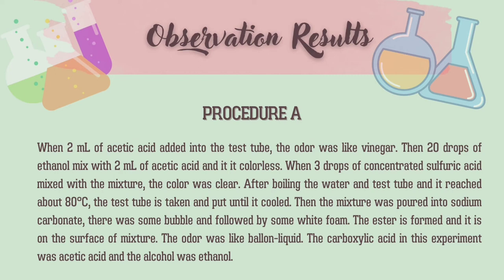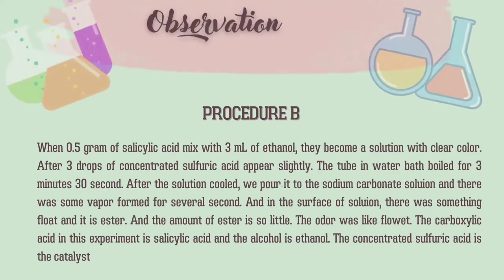taken and put until it cools. Then the mixture poured into sodium carbonate. There was some bubble followed by some white foam. The ester is formed and it is on the surface of the mixture. The odor was like balloon liquid. The carboxylic acid in this experiment was acetic acid and the alcohol is the ethanol.